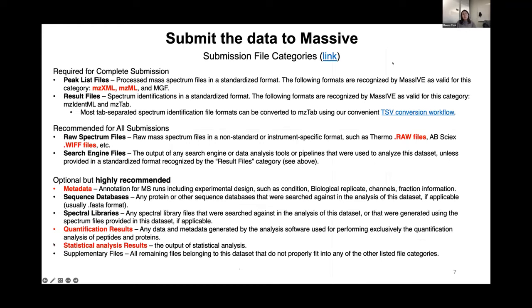To submit a data set to MassIVE and MassIVE-quant, here is the list of items which is highly recommended. What I also learned after I joined Genentech is that they generate many different experiment data and have their own system. But this structure in MassIVE, and then PRIDE, is very helpful for setting up the data infrastructure on the company side as well. And more practically, we have a whole tutorial in the documentation on how we can submit our own data to the public repository.